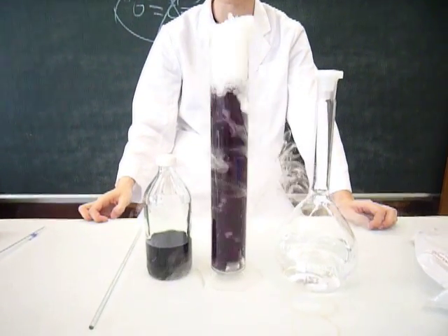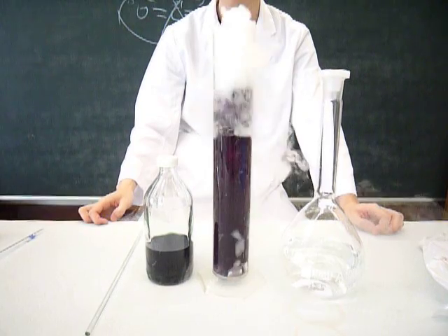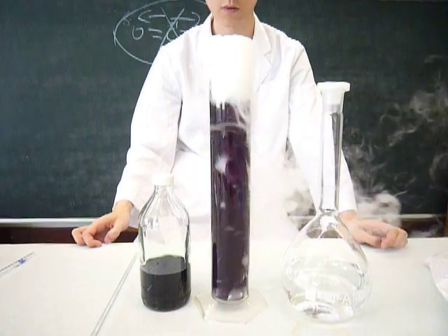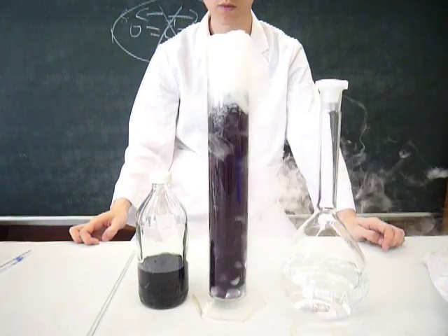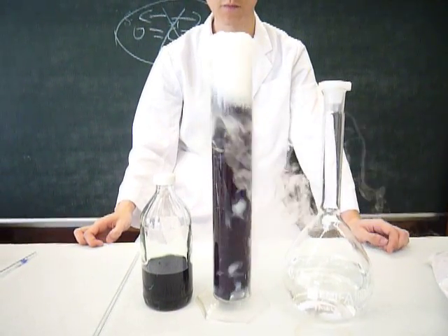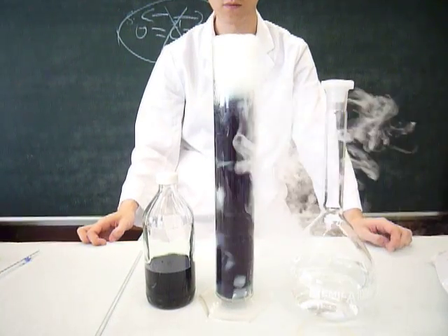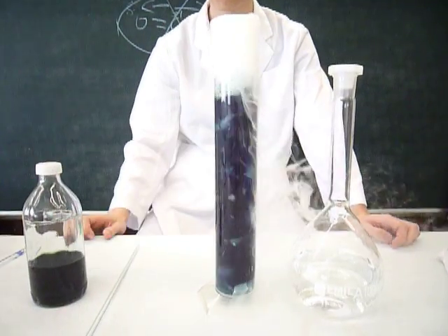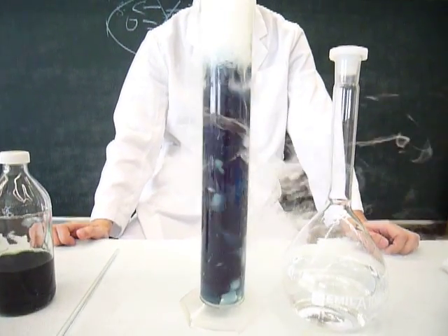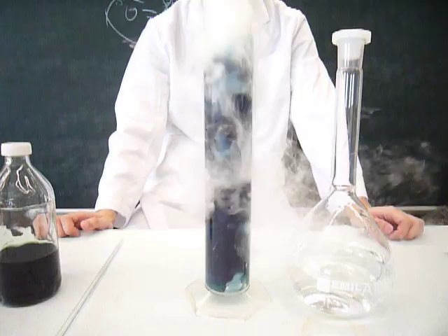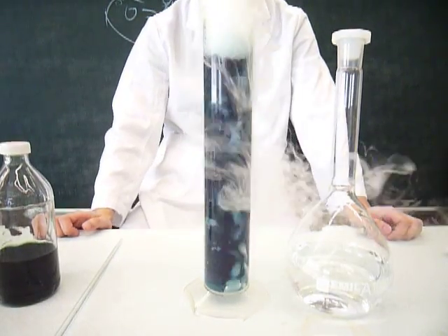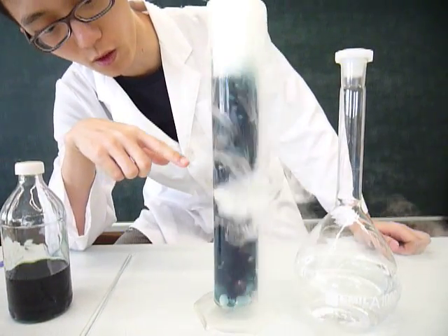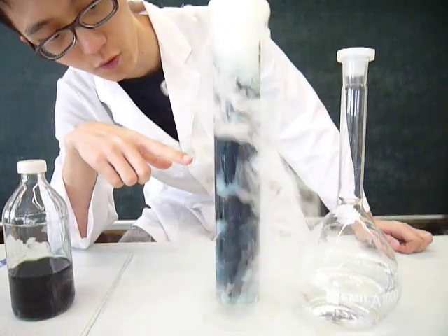Let's see the color change. As you can see, the solution becomes not purple anymore. It has now changed to something like green in color.